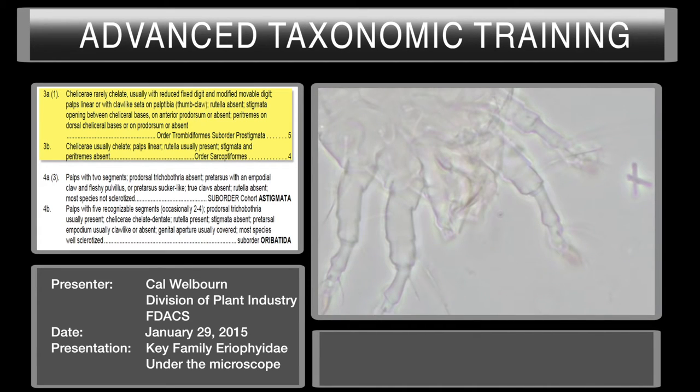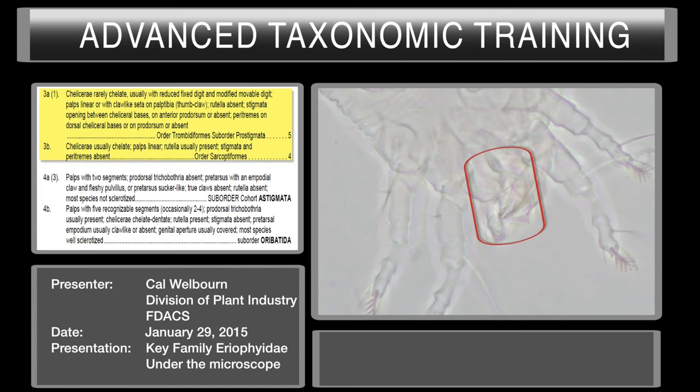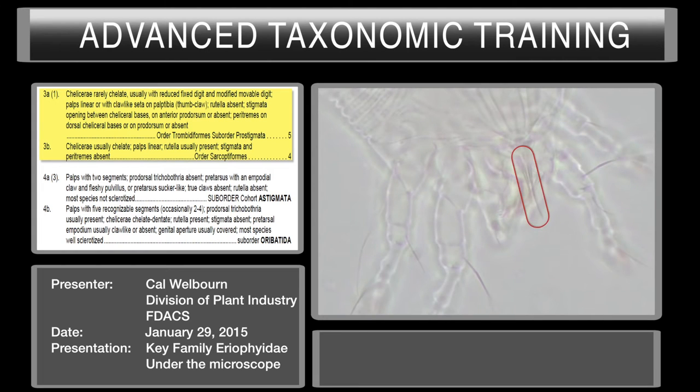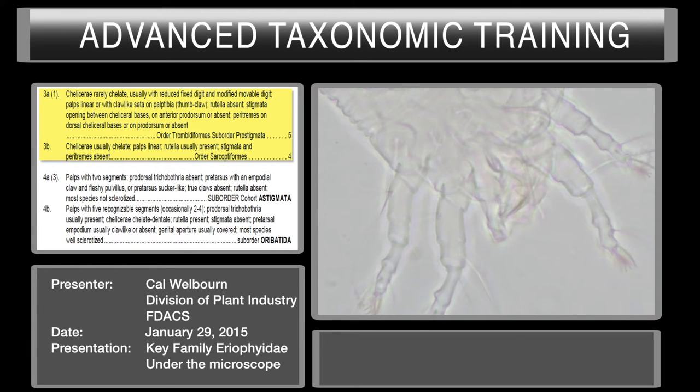We're under oil immersion. We're going to look at the chelicera and the palps. Here's the palp. This is the gnathosoma — this area is the gnathosoma. This is your subcapitulum. And here we have the stylets — this is your chelicera. This is your movable digit; it has several stylets associated with it, up to seven stylets, making up the movable digit of the chelicera. Palps are very reduced. So we have chelicera modified, fixed digit reduced, modified movable digit. Palps are reduced and linear. Rutella absent, stigmata paratremes are not present. So we're going to Prostigmata.